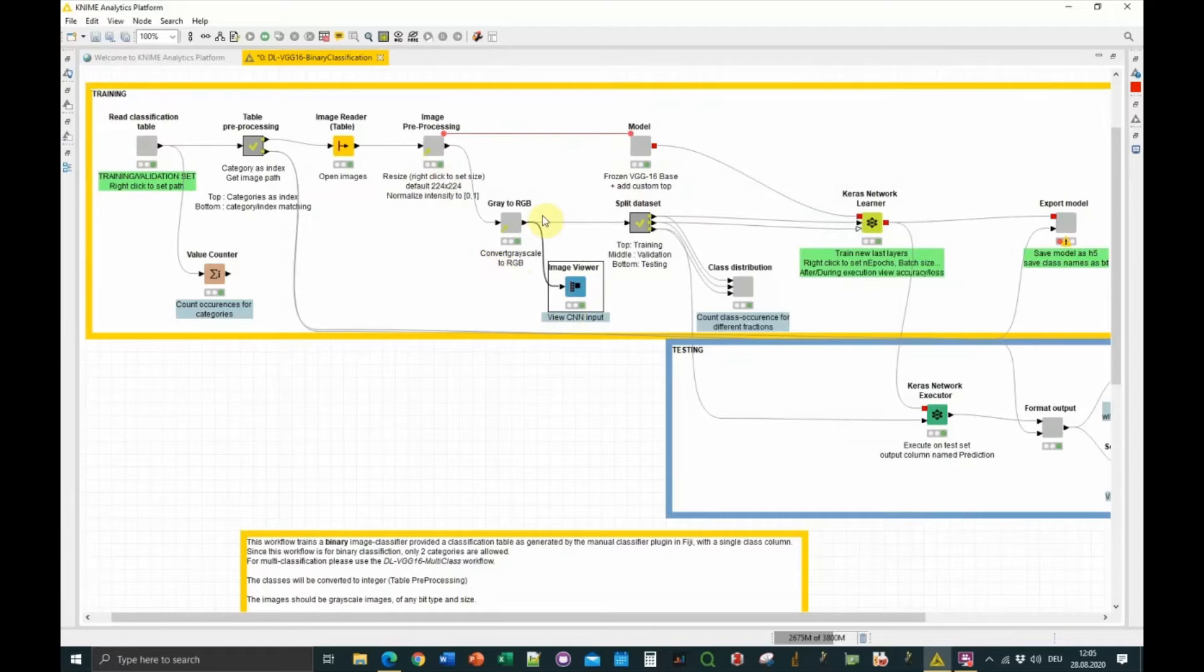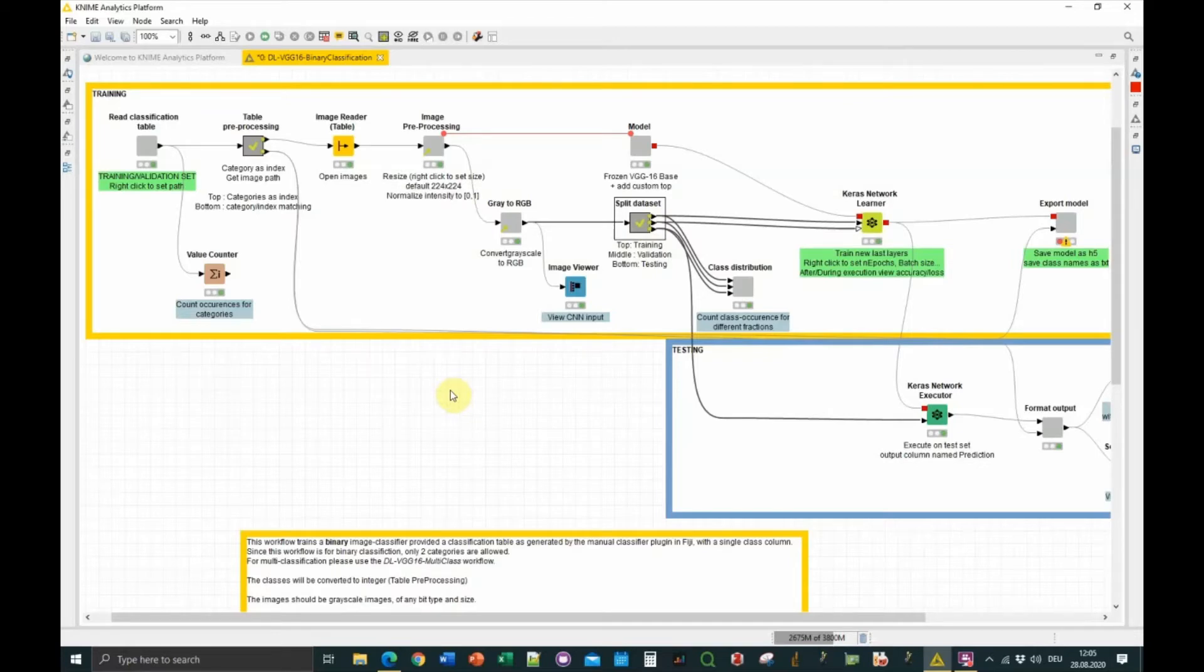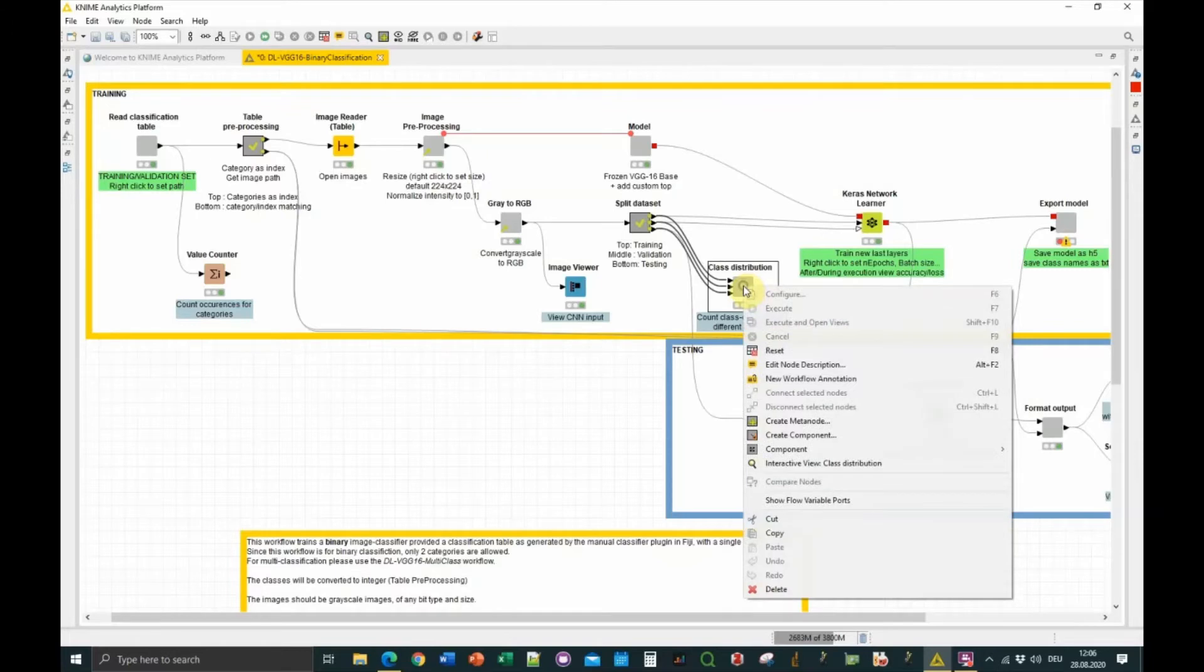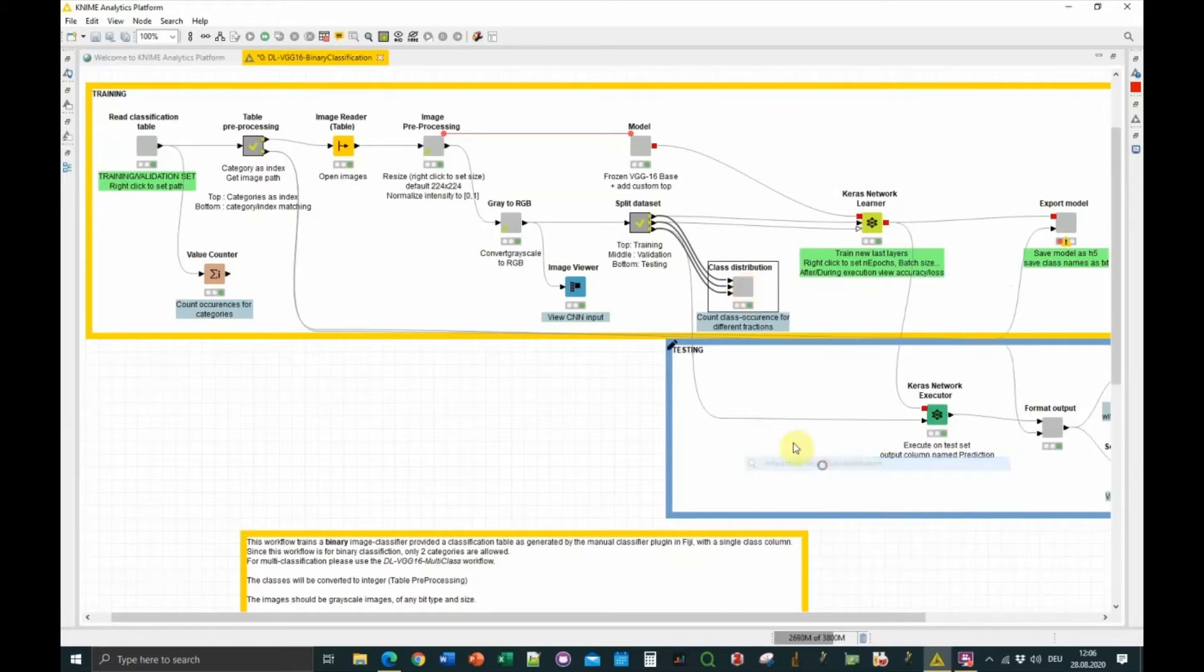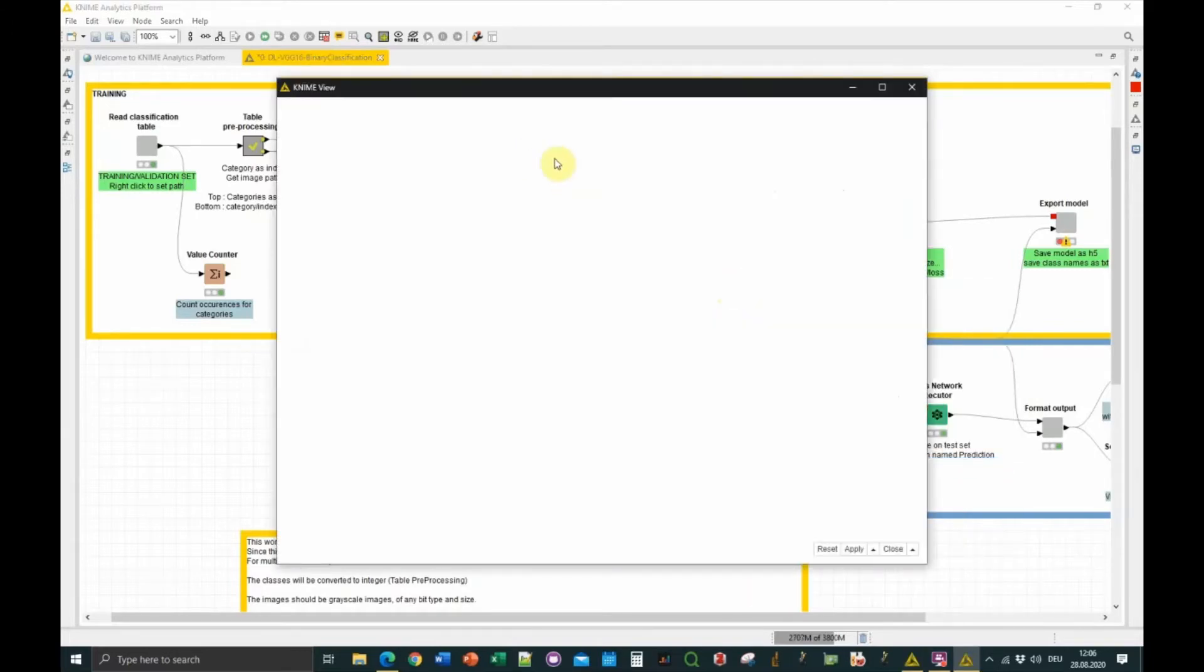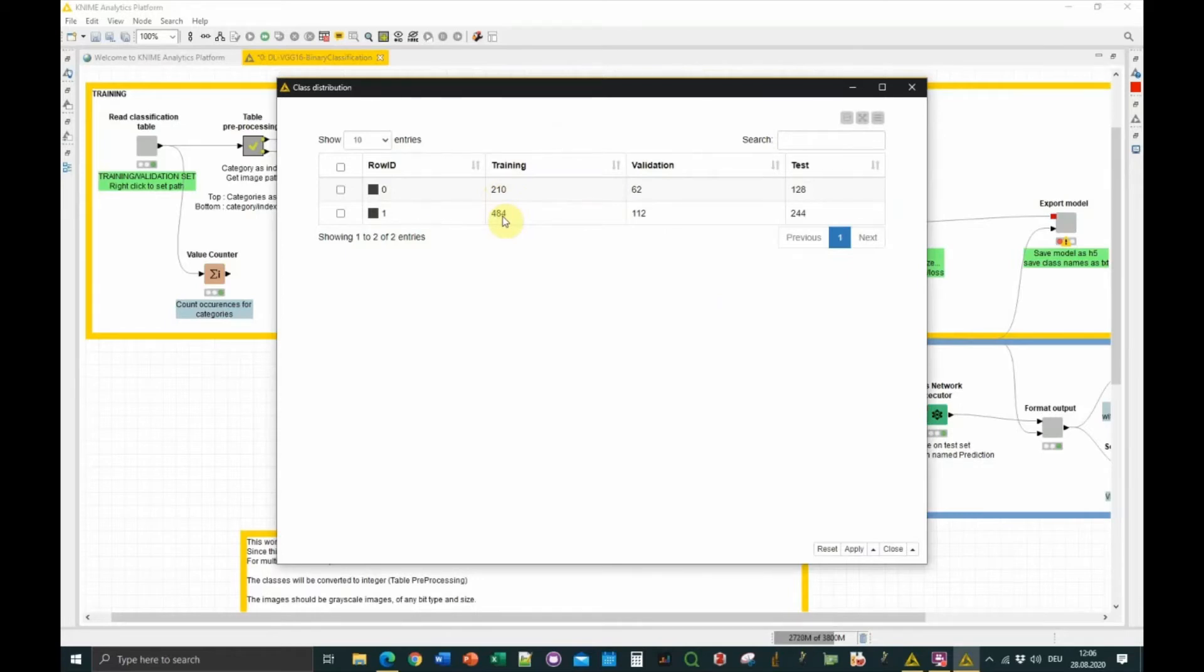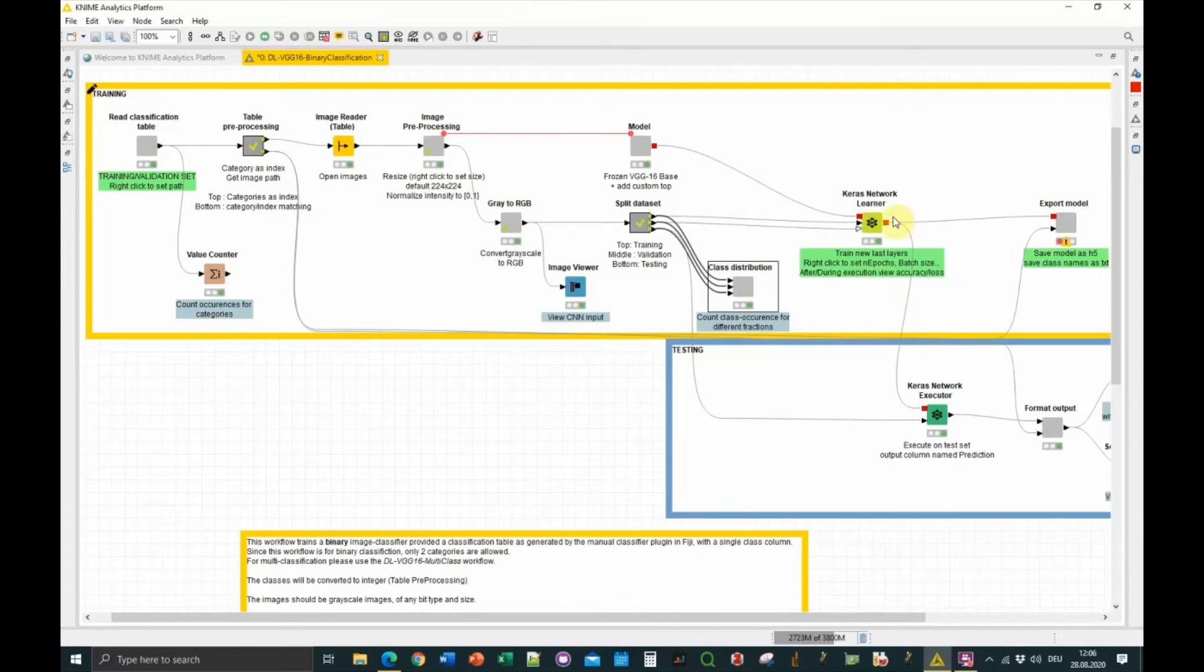The dataset is ready, the ground truth annotated dataset is ready, and then we split it in three fractions. One which is used to train the model, the training fraction, which is about 50% of the dataset. Then a small fraction which is the validation fraction, which is used to check the progress of the training during training. And finally, a test fraction, so once the training is done, to test on new images how it's performing. We can see the distribution, how many images are in those different fractions. The row IDs here, 0 and 1, correspond to the two categories which have been turned to integers for the model. For the training fraction, category 0 has 210 images, 480 for category 2. Validation has a much smaller fraction, and then a test set of 128 and 244.